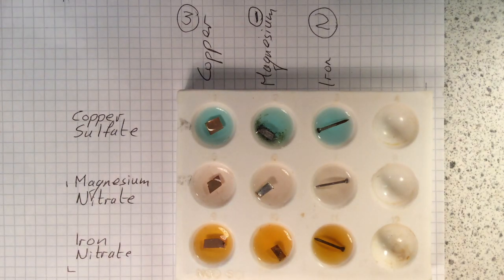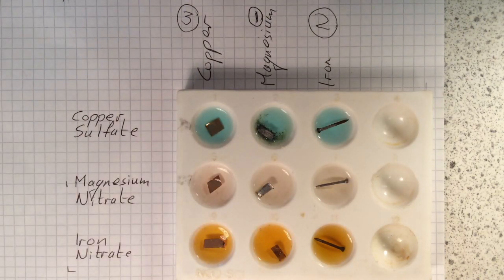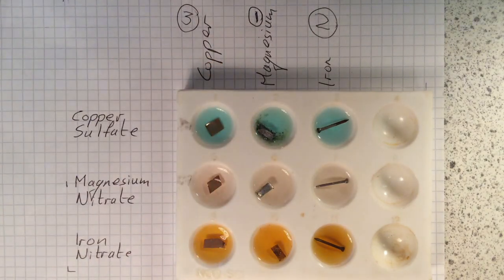Now there is a whole massive thing called a reactivity series, which will put something like about 20 different elements in order of reactivity, and you do that by doing similar kinds of experiments to this. So these are displacement reactions to show the relative reactivity of three metals. We often do it with four metals, but three is just easier to show on this screen here. Okay, so magnesium has displaced copper from the copper sulfate, which is why we call it a displacement reaction.